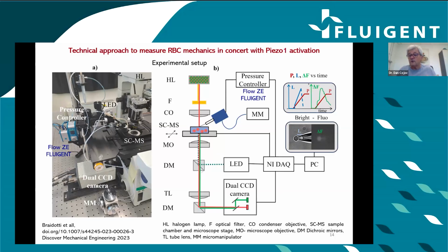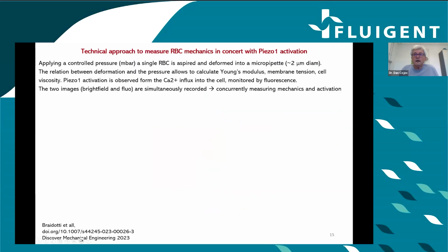And this is, in our opinion, a big advantage because we can study both mechanics and Piezo1 activation for single cells at the same time. In the image here, you see the Hamamatsu camera, the microscope, and the Fluigent pressure device.